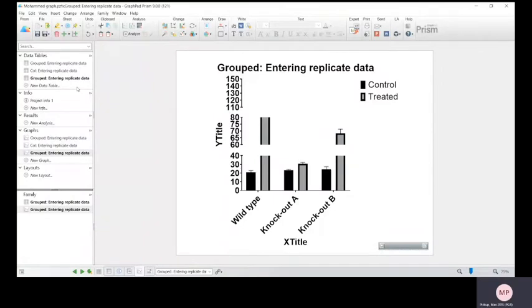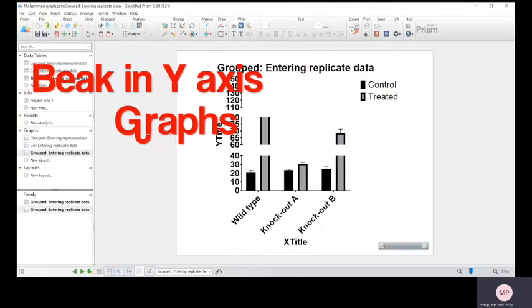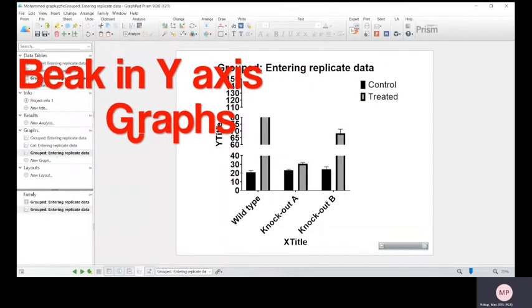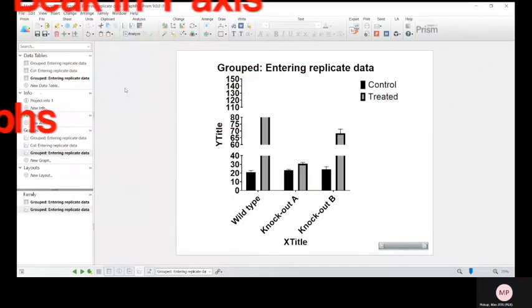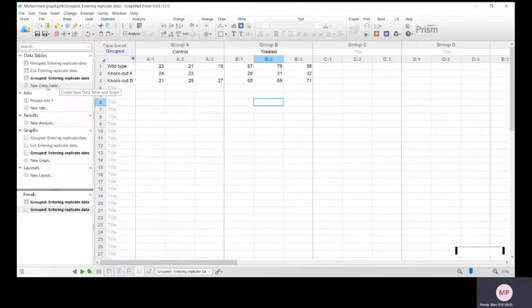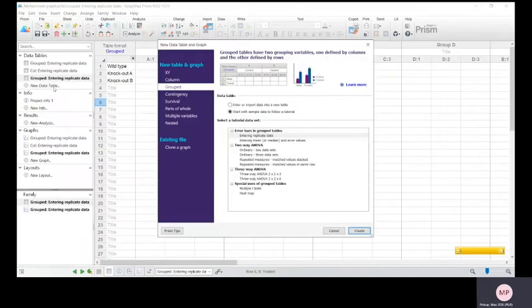I'm going to show you how to do a break in the y-axis on GraphPad. If you are making a new graph, you want to go to data tables and add a new data table.